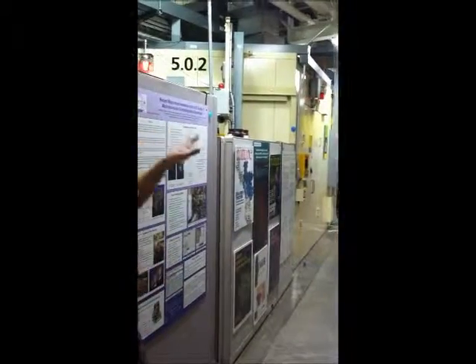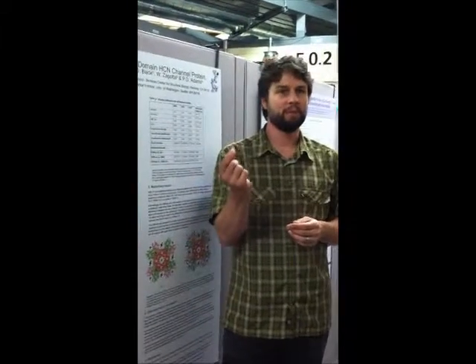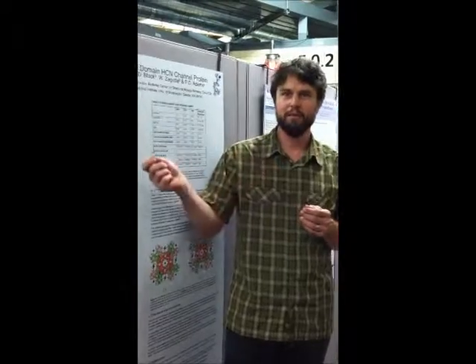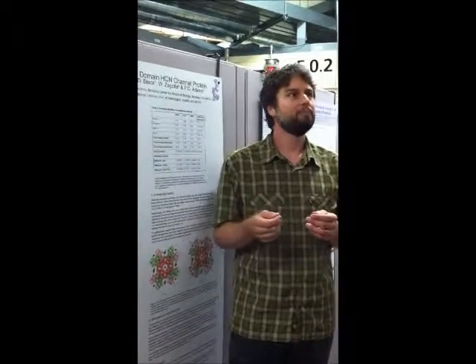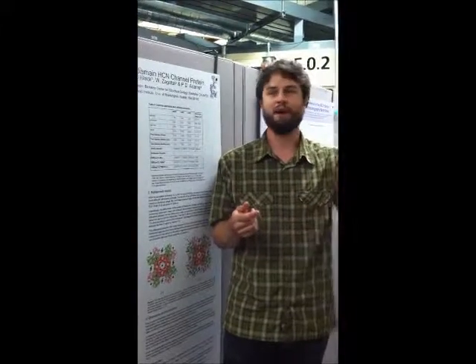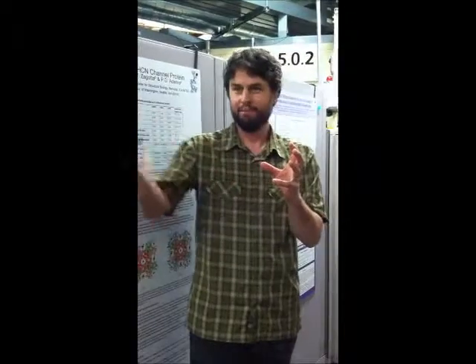The reason that these are in a room rather than in a vacuum chamber is that the protein samples are actually frozen crystals of protein. If you know technically what a crystal is, it's a regularly repeating array of atoms, right? Making a protein crystallize is actually extremely difficult because these are thousands of atoms in a super complicated molecule. You have to make that repeat over and over and over. So that's like a scientific field in and of itself, just making the samples.